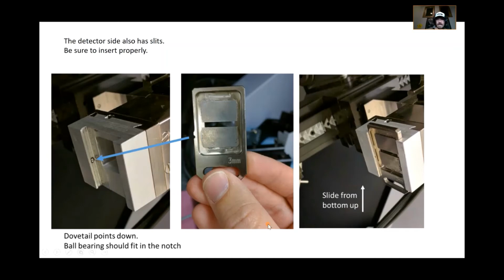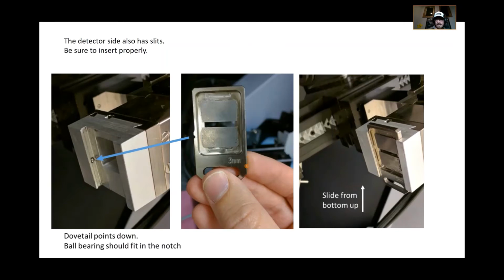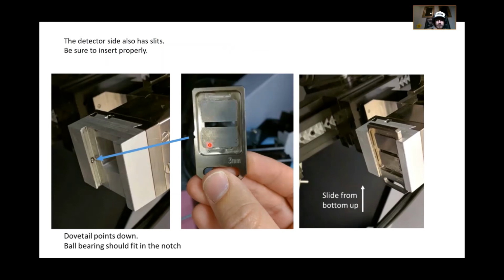These slits are actually composed of lead, and so you don't really want to touch them. And I'm almost thinking I'm showing bad PPE habits by not wearing gloves. But there are people that say you're not supposed to wear gloves when you handle instrumentation, so I kind of argue against that as well. But these, hopefully you see the pointer. Let me get to a laser pointer. These are lead.